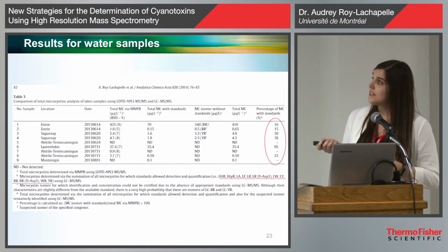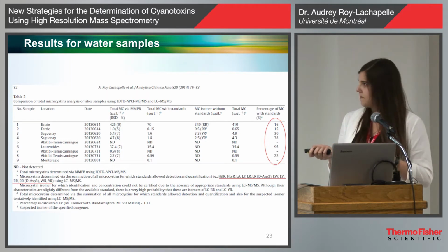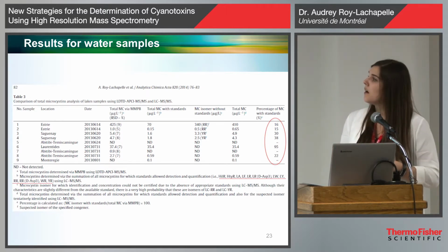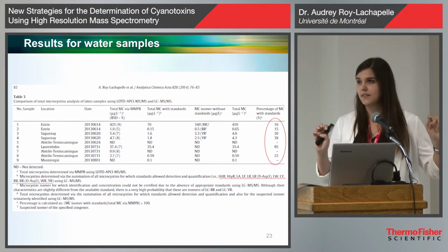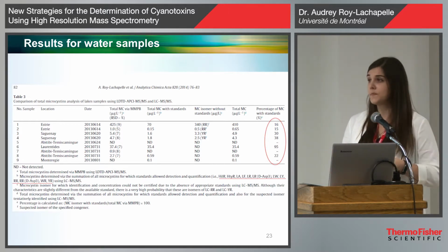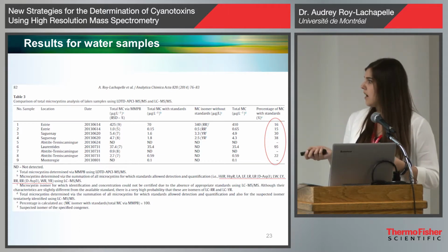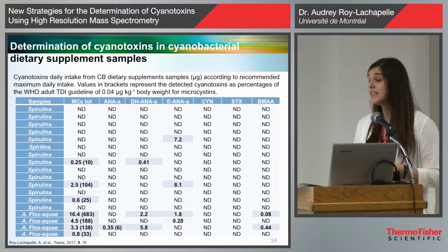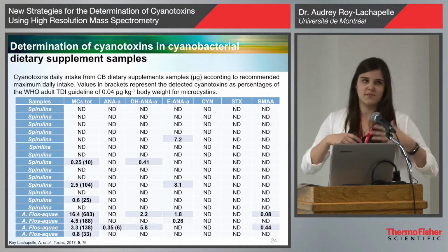We first did this experiment with water, and we had the same conclusion. We saw more microcystins using the total microcystin technique compared to an LC-MS analysis with all the individual microcystins. With all these techniques, we were really curious about other samples.